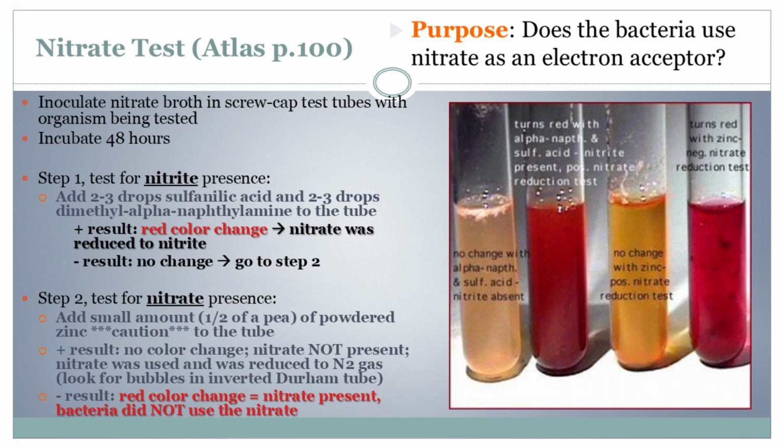But how do we even begin to figure that out? Well, that's where our star of the show comes in. The nitrate reduction test. Okay, so big picture first. What's the main goal of this test? So basically, we're trying to figure out if certain bacteria are capable of substituting nitrate for oxygen in their respiration process. So we're looking for those nitrate-loving bacteria, the ones that can thrive even in environments without oxygen. Exactly. We call this anaerobic respiration, and it's more common than you might think.